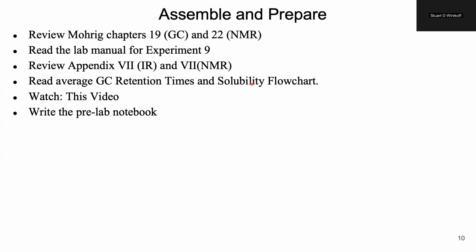And then make sure to write the pre-lab notebook, including all of this information, specifically the procedures from the lab manual, both appendices, specifically 7, and again, the GC retention times and that solubility flow chart. So again, there's a lot of procedural information in these manuals that I'm not covering here. I highly encourage you use it. Make sure you answer the questions to consider.